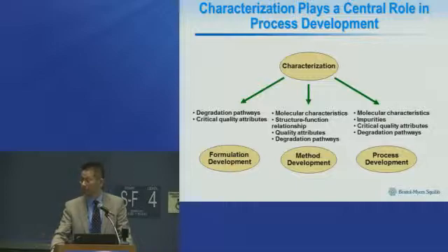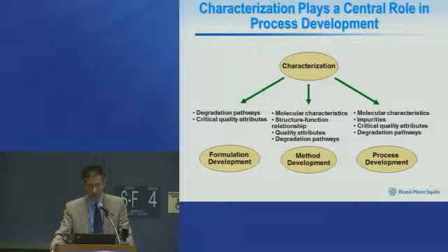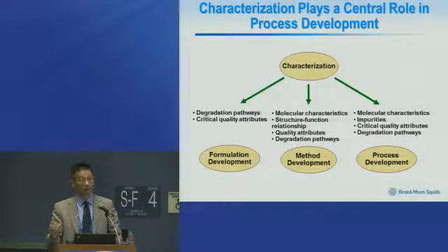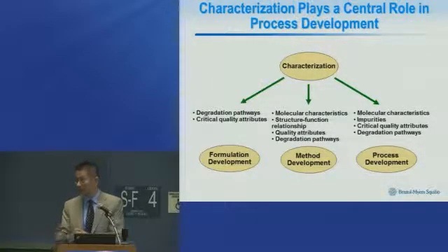After listening to you guys talk, I realized this, actually I dragged this from another slide and put it here, just to provide a link between method development, which you guys did a wonderful job on, and our work, which is characterization. Just to put it simply, characterization is about characterizing the molecule, or how, just like a person, how you look, right? And then over time, everybody will age. Some of us may age faster under stress conditions, and some go slower.